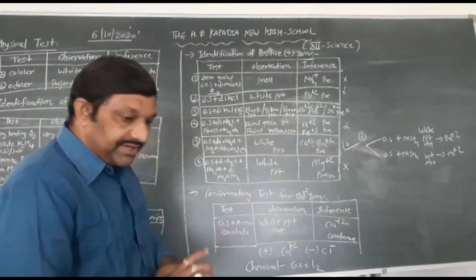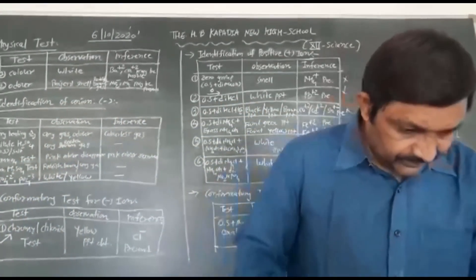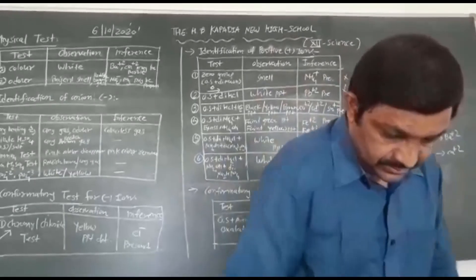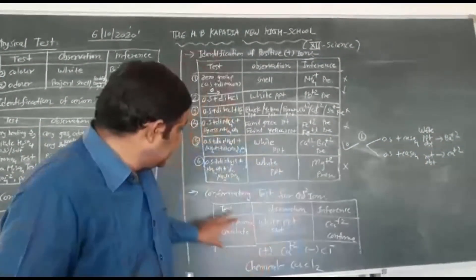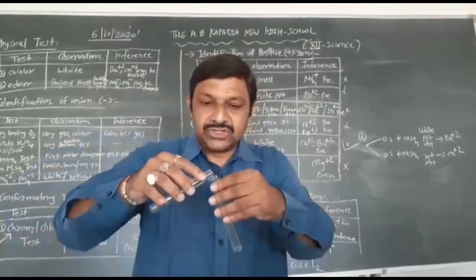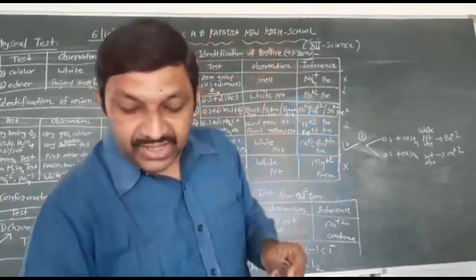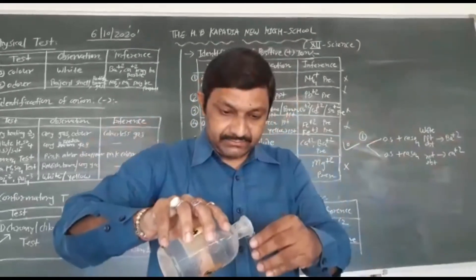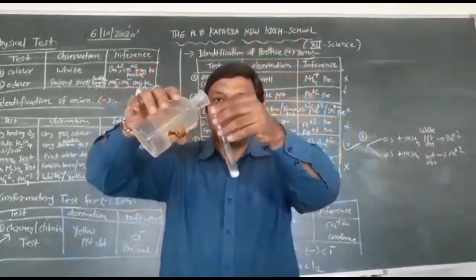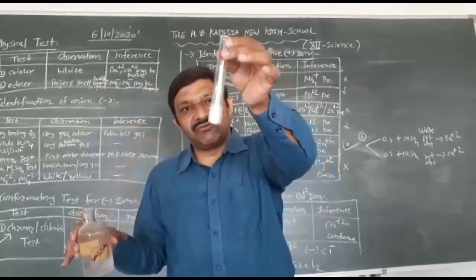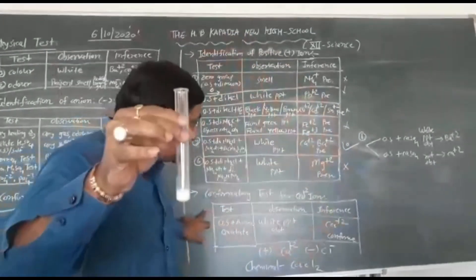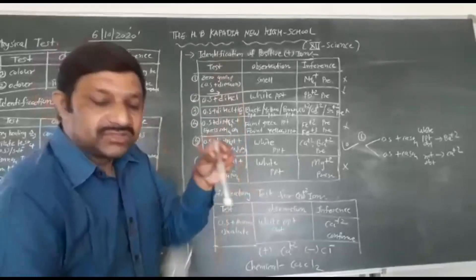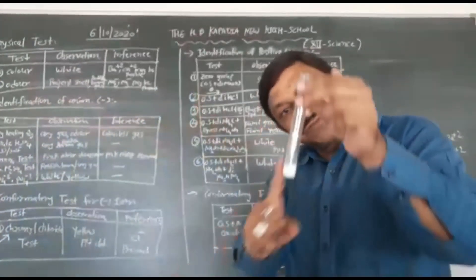Finally, the confirmatory test: original solution plus ammonium oxalate — white PPTs are obtained. Here is your ammonium oxalate. You can see white PPTs obtained. So your confirmatory test of Ca²⁺ is: original solution plus ammonium oxalate → white PPTs obtained. Confirmatory test is complete.